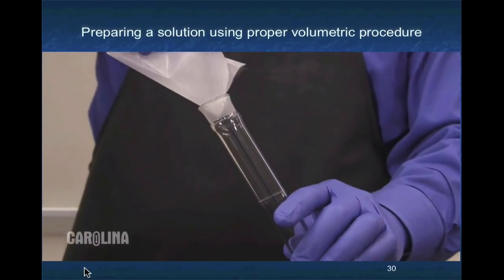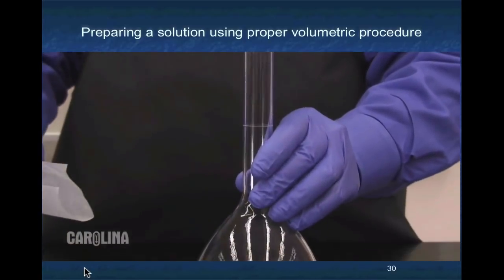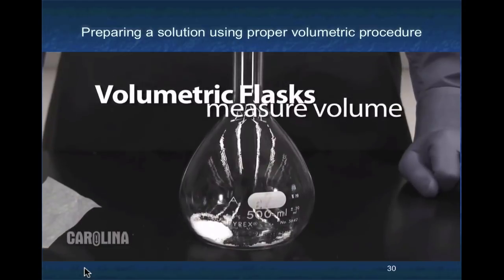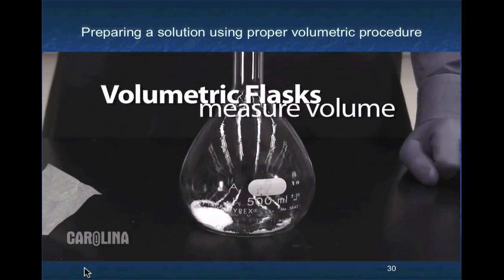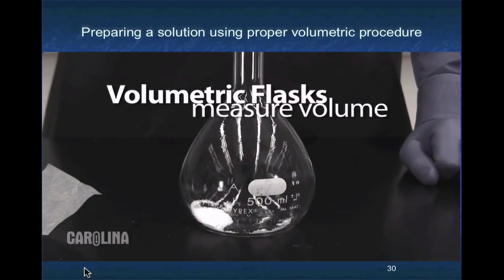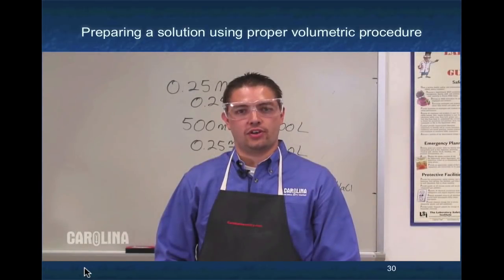Volumetric flasks are made specifically for this purpose and should be used over other less accurate labware, such as beakers, Erlenmeyer flasks, or graduated cylinders. Here, we just transferred our solute to the 500 milliliter volumetric flask.